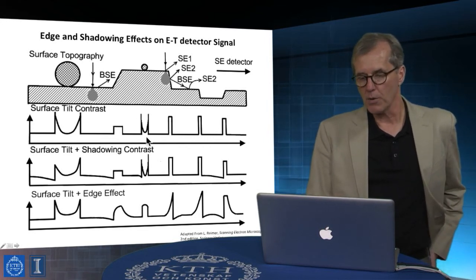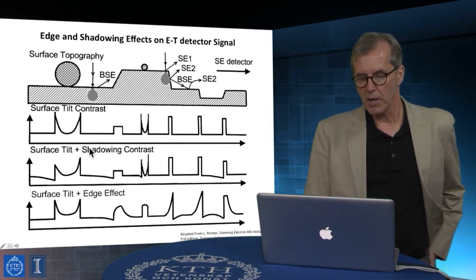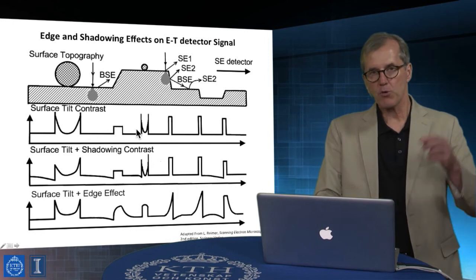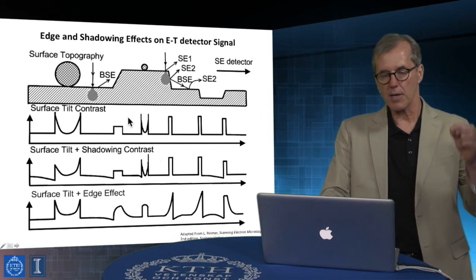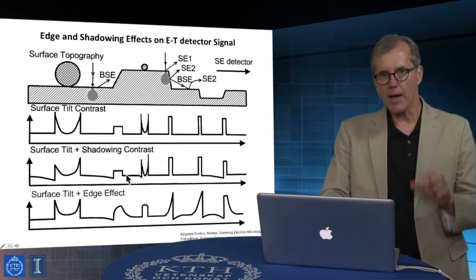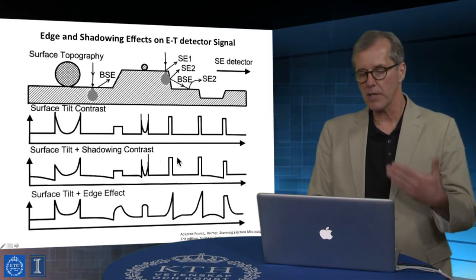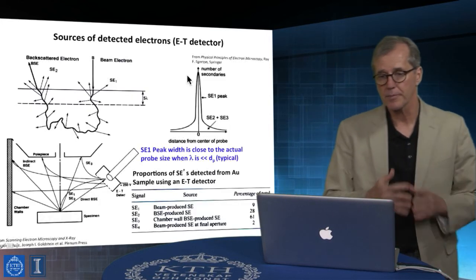And at normal angle of incidence, this might appear to be symmetric, but it would also be impacted by surface tilts. And what we can see is that if we try to use image contrasts as a way of defining both feature sizes and heights, we would wind up with information that's a little bit deceptive, because intensity does not scale linearly with height because of these shadowing effects.